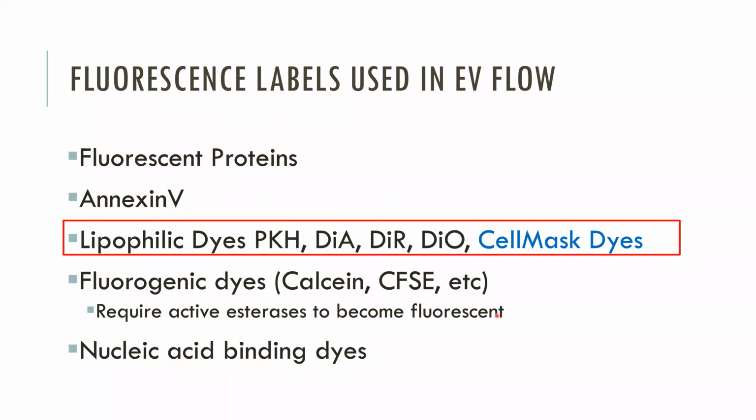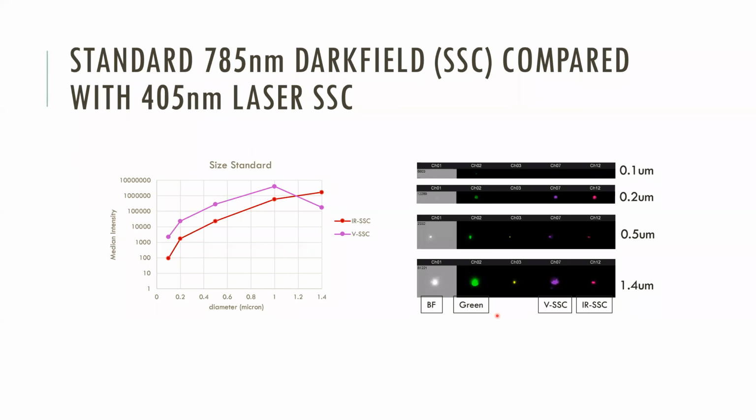There is one from Thorsten about is there a commercial viral standard for size, potentially using viral particles? Yeah, I've seen that as well. I don't think that anybody has that sized in a way that within the field it's supported as a standard. I don't know how uniform viruses are in size, so I really would have a hard time answering that question.